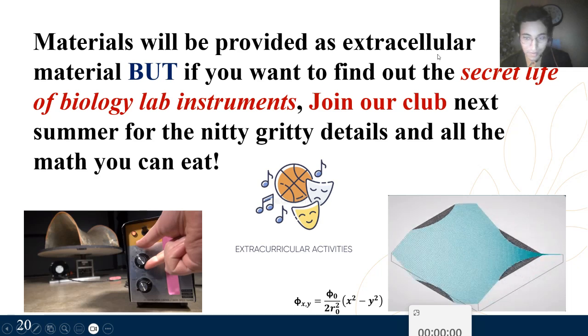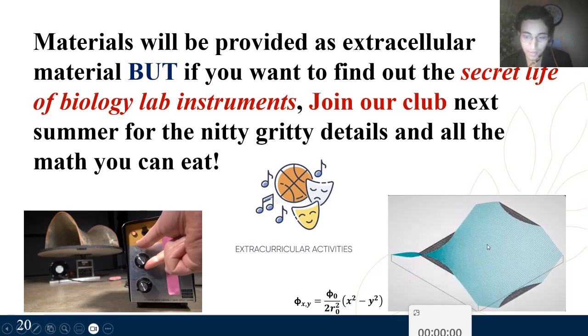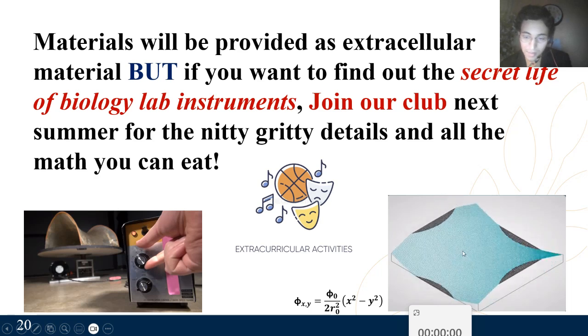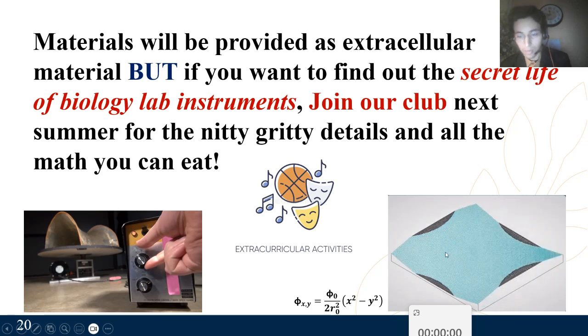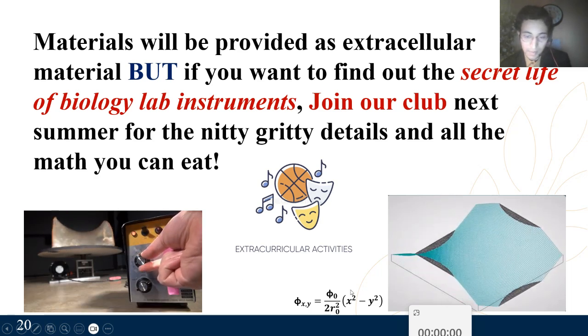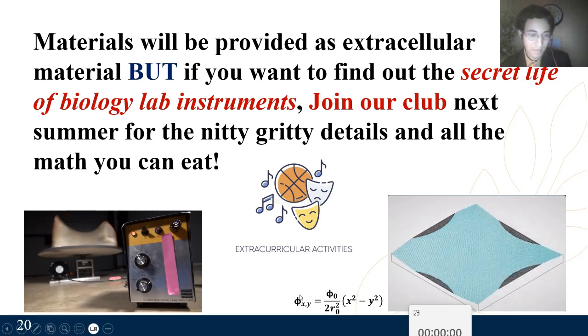This is a potential field that is created from the quadrupole. Like you can imagine an ion here, it's a positive ion. It tries to go to the negative, then gets pushed back, then tries to go to the negative, then gets pushed back. And it's like this saddle here. This is the equation for the potential field, of course. We will derive it and we will know how it's all brought up. We will read all the books that are necessary for it.